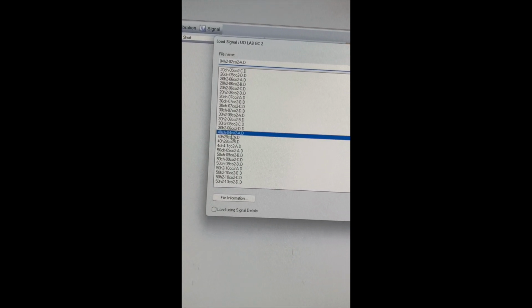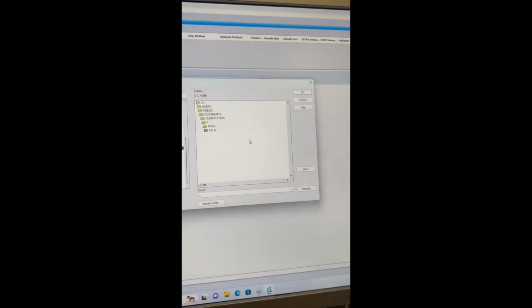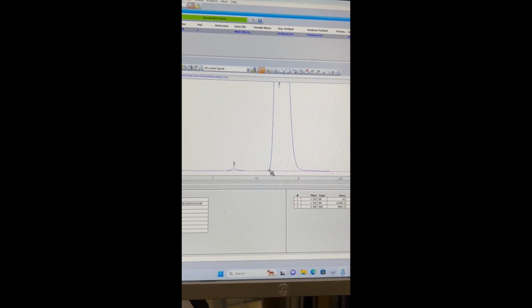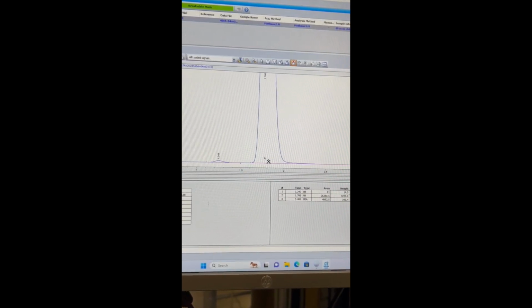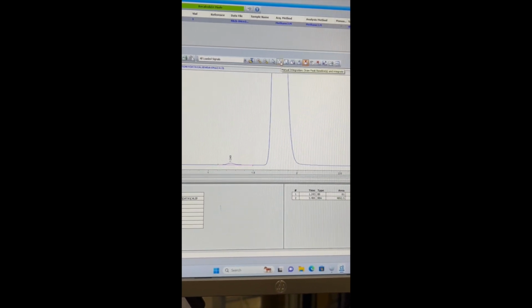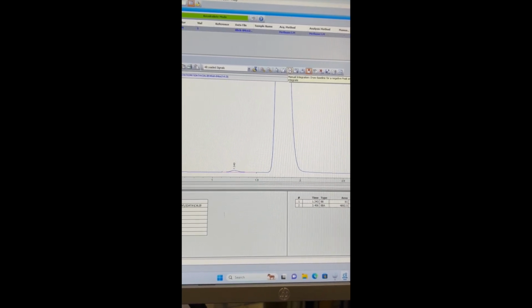So here is the run that I did in this example. And you can go over here to OK. And you'll see we have nice integration lines with both of these peaks. And to remove it, you can use this manual integration removal. And just for an example, you can either do manual integration for positive peaks or for negative.